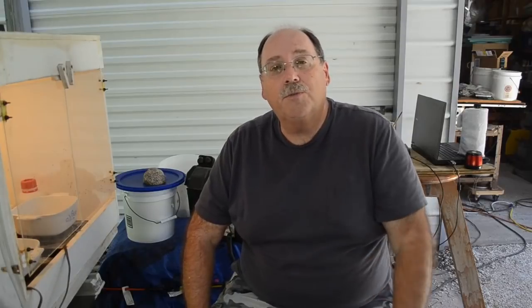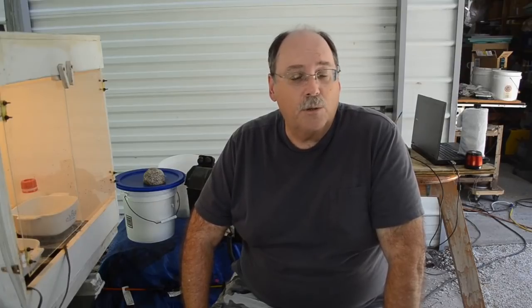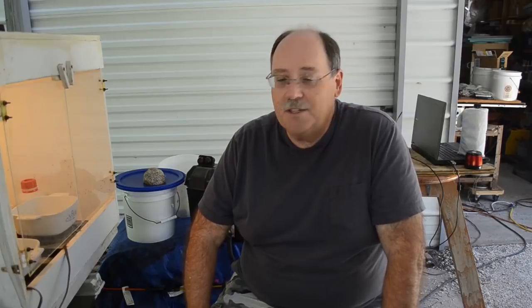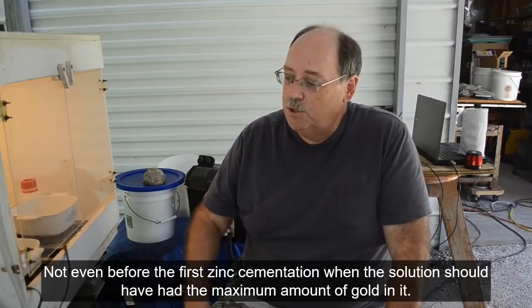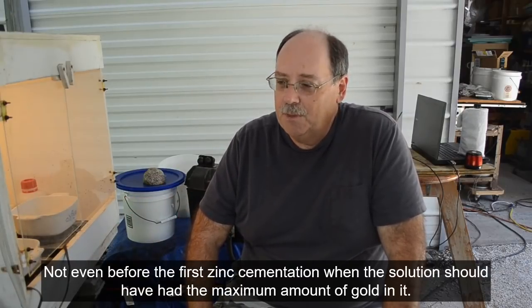Oh, I almost forgot. There is one other bit of information I want to share with you. Can't get the stannous chloride test to work with this stuff. The Eco-Goldex instructions say it'll work. No, it doesn't work. I tried it off camera, and it didn't work. It's never worked. I don't know why. Even the original solution, when it was still loaded with gold, no indication at all with stannous chloride that there was any gold in it. So, don't know why it doesn't work. Don't know why they say it works when it doesn't. So, keep that in mind.